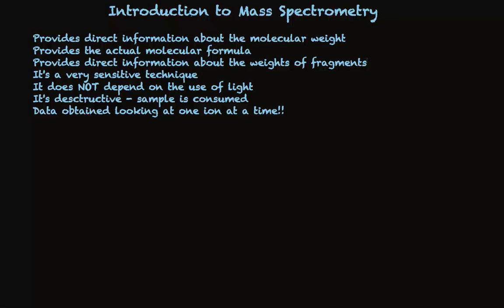Well, how would an instrument like this work? Sounds like magic, and it's close to magic. Pretty close, reaches beyond the bounds of believability. But here it is. In a machine which uses a mass spectrometer, there's an electron beam. These electrons are traveling very, very fast.